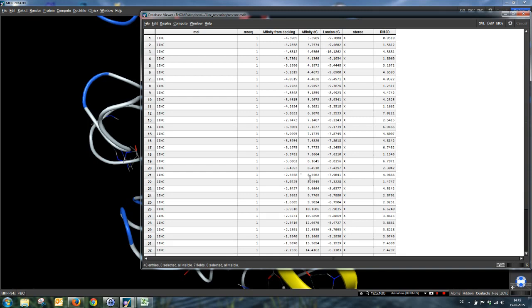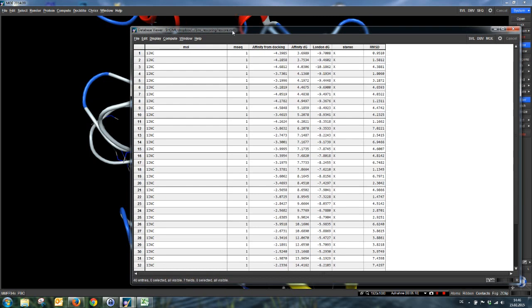DSX is not implemented in Mo yet, but I show you a little workaround how you can get the results from DSX into our RescoreMDB. It's a little bit tricky, but maybe someday it will be one of the implemented scoring functions.